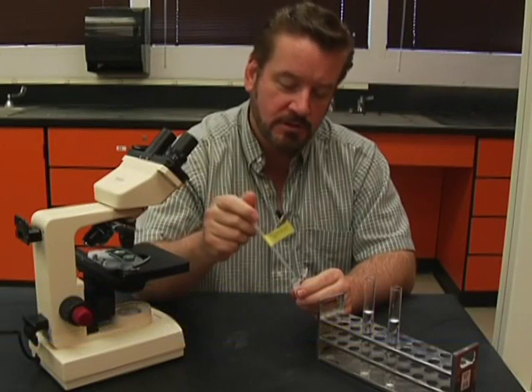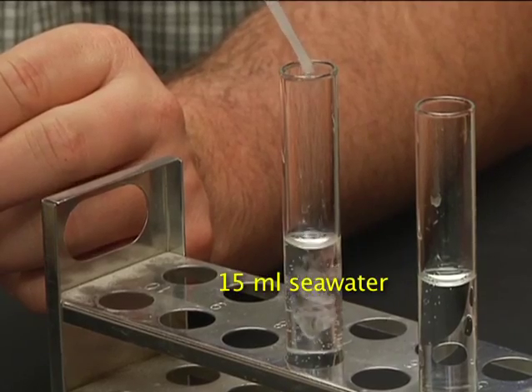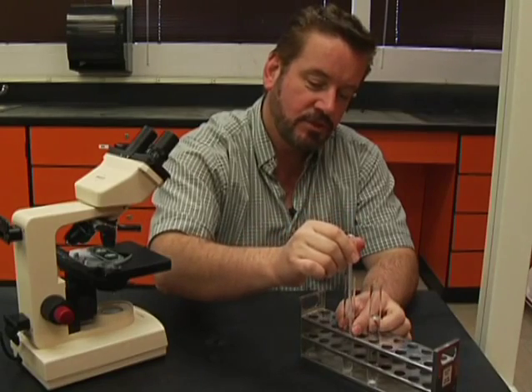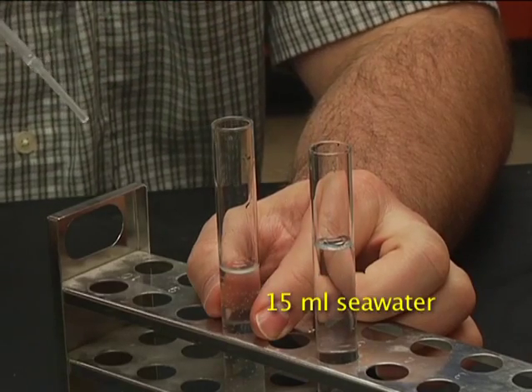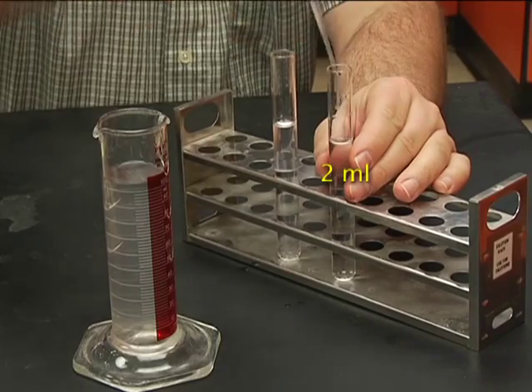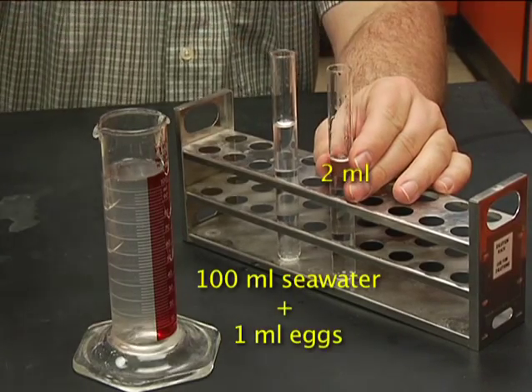To prepare the sperm dilution, place a couple drops of sperm in 15 milliliters of seawater. Mix the sperm solution and transfer one milliliter into another 15 milliliters of seawater. Then transfer two milliliters of the dilute sperm solution into 100 milliliters of seawater with one milliliter of eggs.